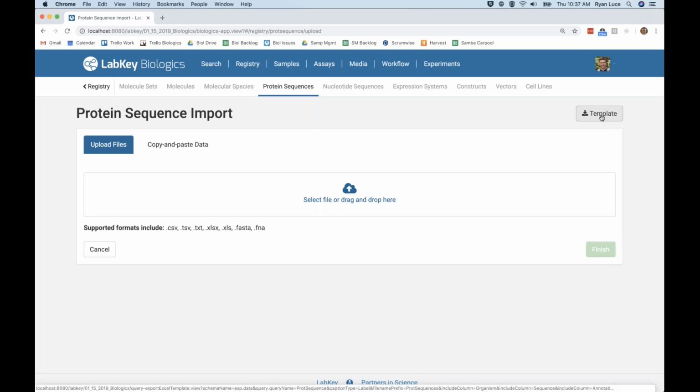Great. Another question here, and this one is kind of a two-parter. Does everything start with an entity? This user is a genomics core lab and everything is project or experiment based. How customizable is LabKey for overall workflow?